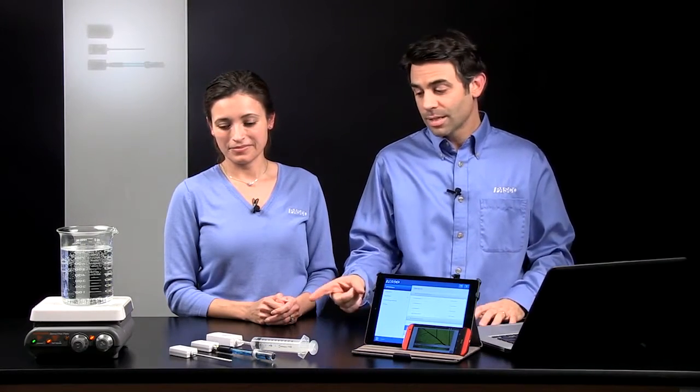Tom can tell you a little bit more about how easy they are to use. How easy are they to connect, Tom? Well, let me tell you. All the wireless sensors are going to be using Bluetooth Low Energy to connect to your devices. Some of the wireless sensors, like the wireless pressure, will connect via Bluetooth Low Energy and via USB.